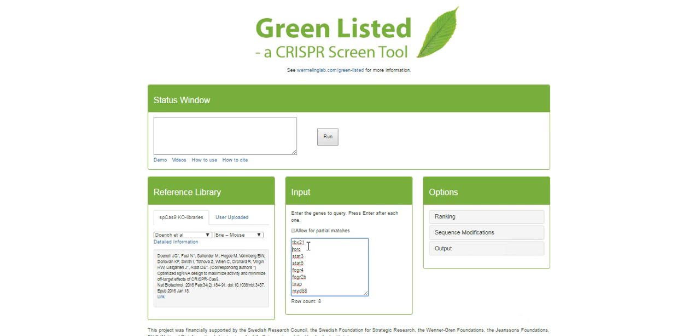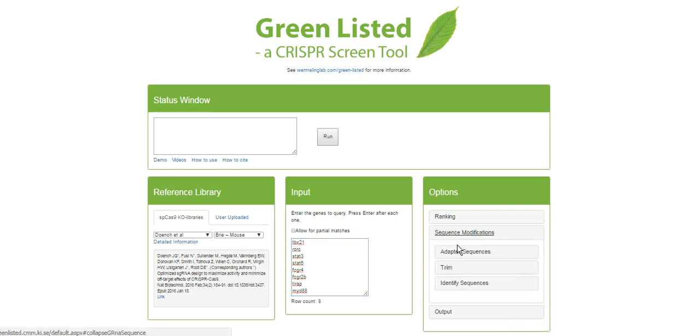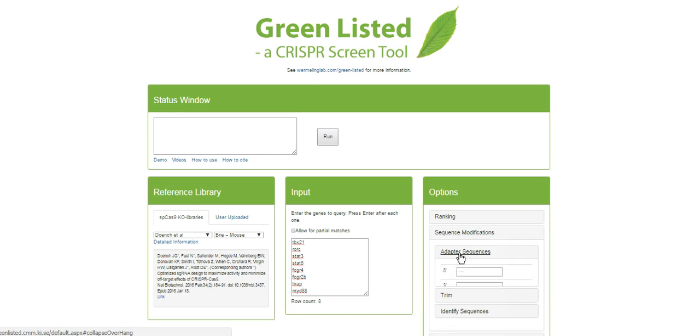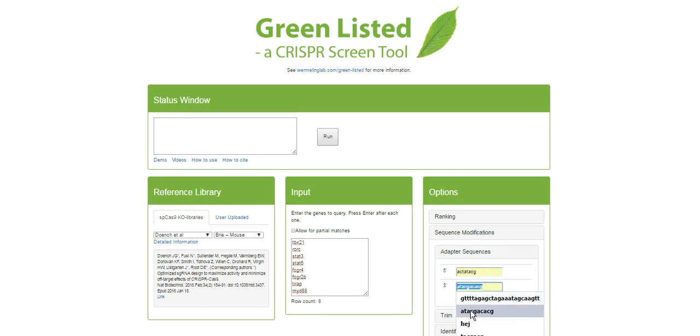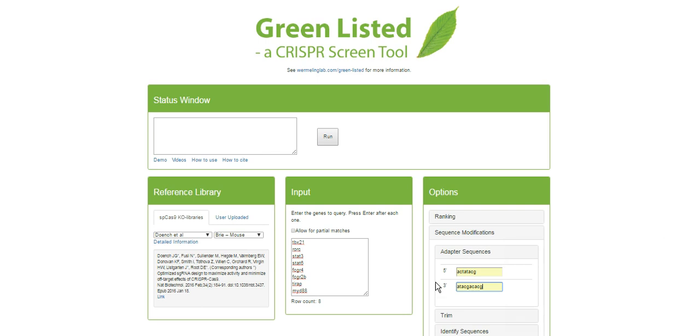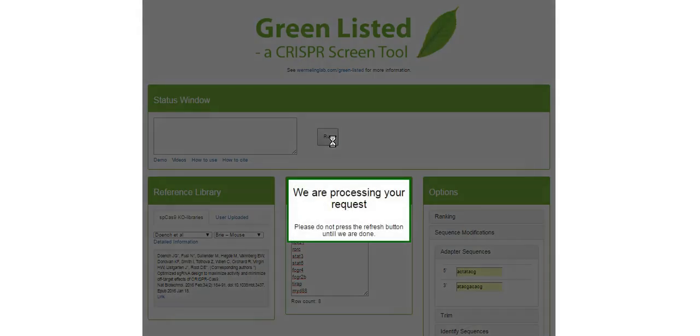And these guide RNAs are roughly 20, for this library, they're 20 base pairs long. But of course, if you want to use those guide RNAs for spacer sequences, you need to clone them into some kind of vector, expression vector. And to do that, you need overhangs. And you can go in here, and then say, I want this type of five prime overhang, and I want this type of three prime overhang. So you're asking the software, design guide RNAs based on this publication against these genes, and have these sequences flanking. Press run.